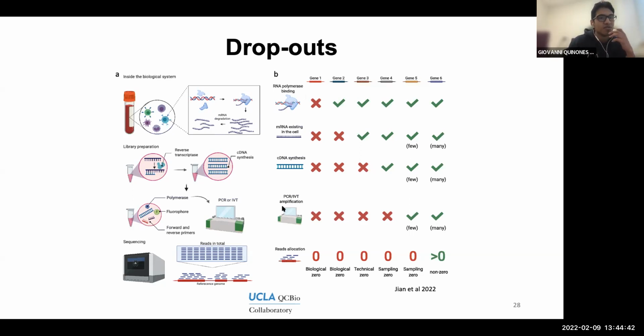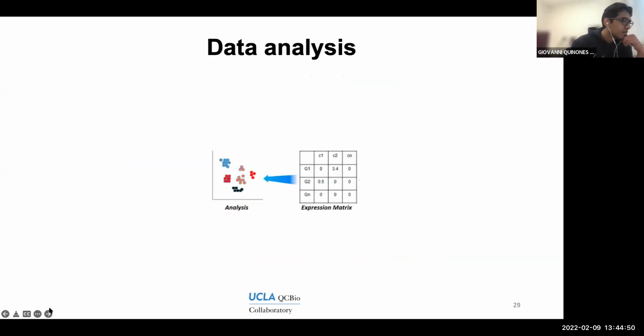So now we're going to move on into the material for day 2. And to do that, I wanted to revisit the slide I showed yesterday for the whole pipeline, all the steps in the single cell RNA sequencing data analysis.